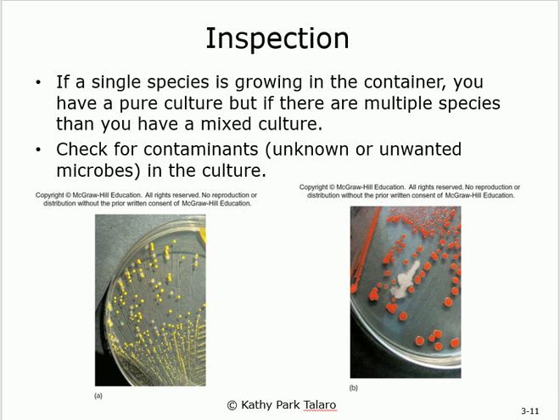The next step is to inspect. If this is a pure culture, you have one organism only, this is easy. You are going to inspect it, you look at it first, and we will see the details, see how it looks, what changed. And then you can look under the microscope and tell exactly the details. This is if it's a pure culture. If it's a mixed culture, this will be something different. You need to recognize the different colonies.